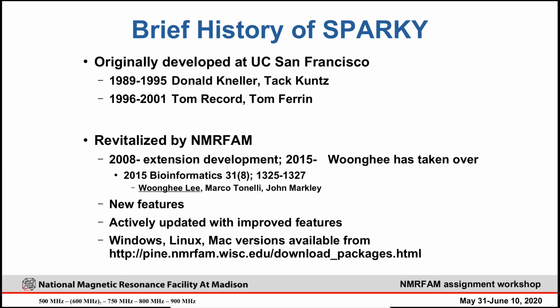That was picked up by myself. I was a developer of my own software tools, so I had been developing integrations to Sparky since 2008, such as the Pine Sparky plugin and Ponderosa plugins, and then I took it over officially from UCSF. That was in 2015, and we rebranded the name to NMRFAM Sparky.